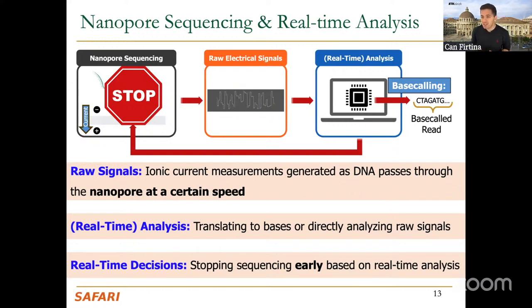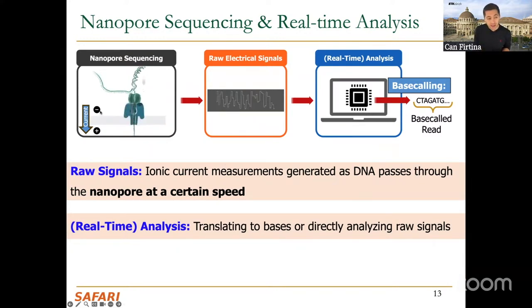How it works is essentially not magic. Assume we send the signal to a sequencer. Then for a short fraction of time, the voltage is applied in the other direction. So now this side is positively charged and this side is negatively charged. What's going to happen is that the DNA will still move towards the positively charged side, which is now the upper part of this region.